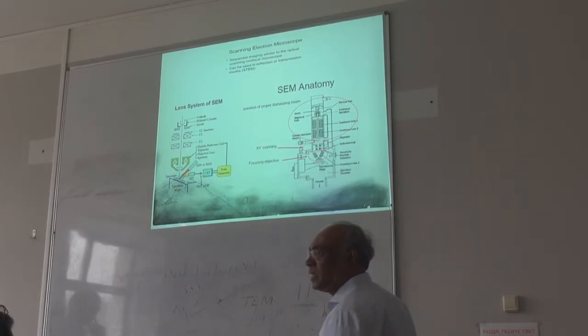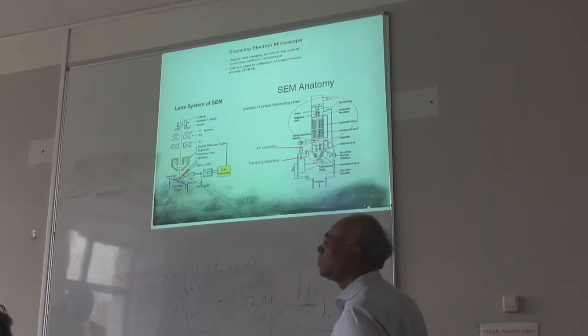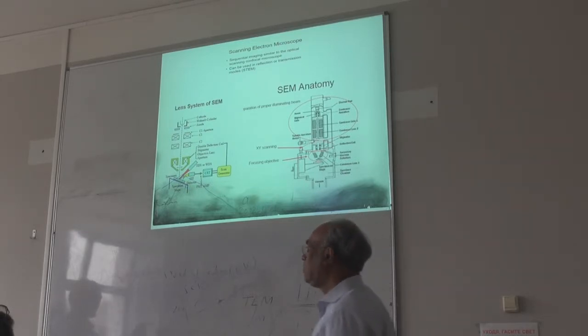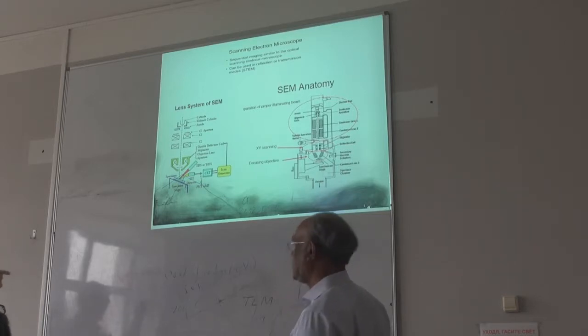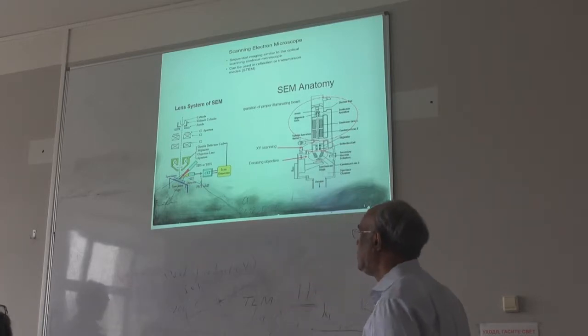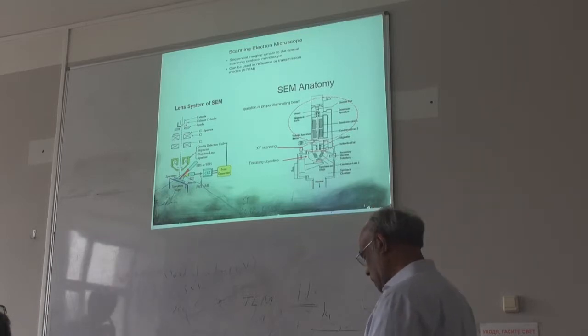The beam is scanning through the sample. You can do either the beam or the sample. We do magnetic scanning using a magnetic lens. Yes, that's what we do. No mechanical movement. Yes, exactly.